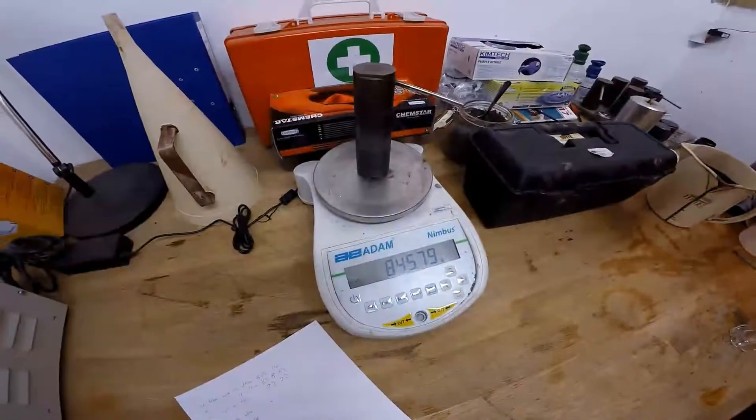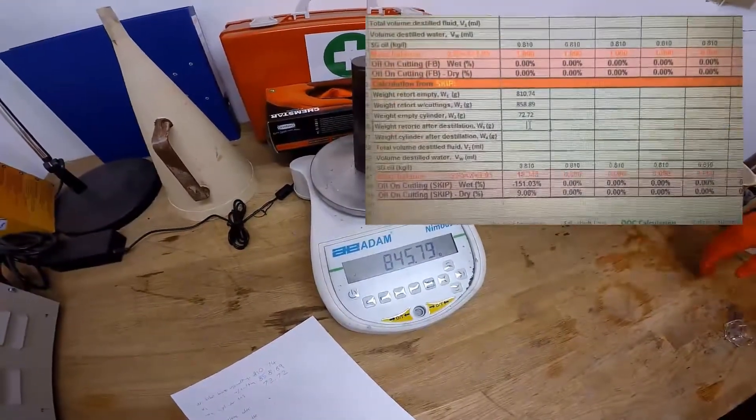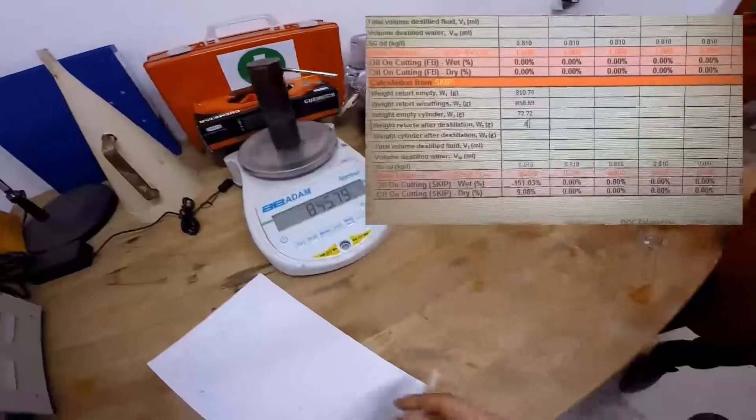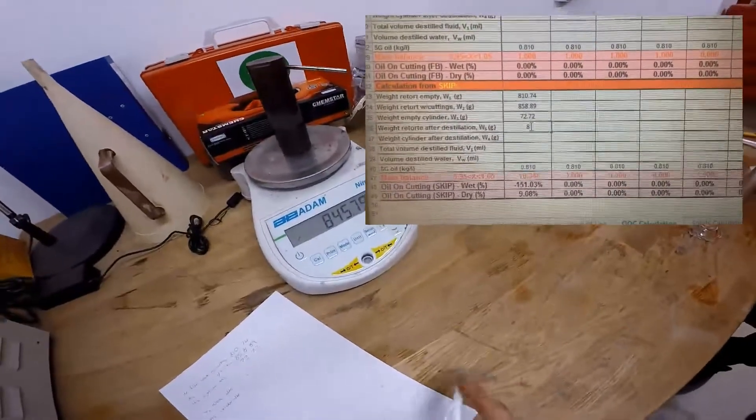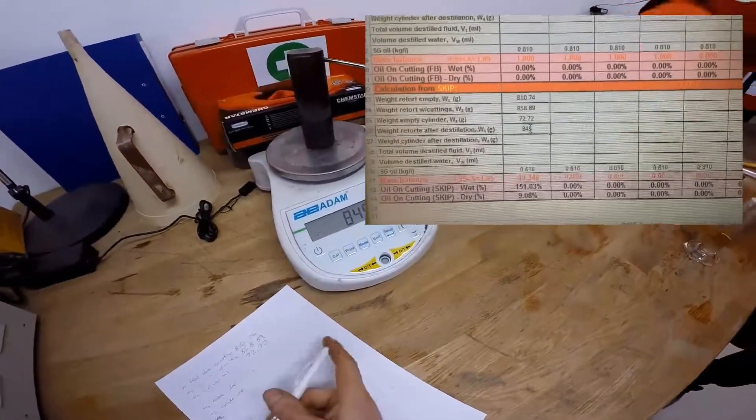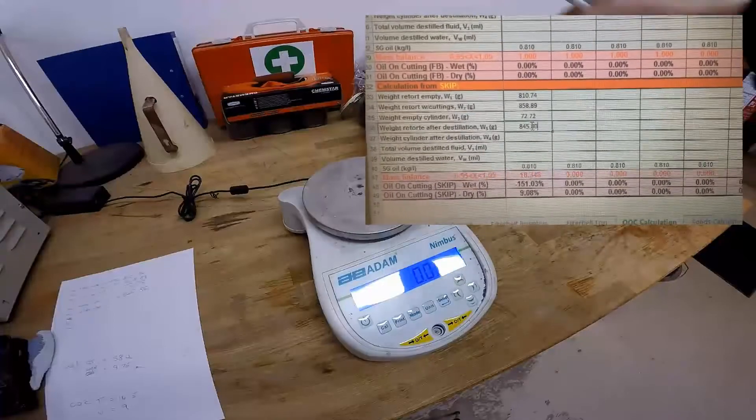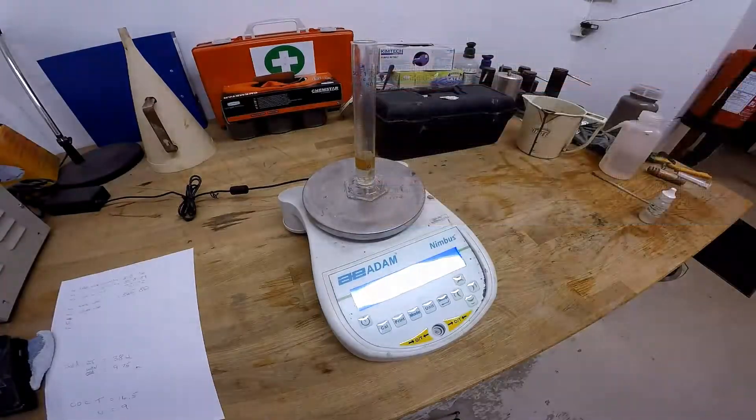So we need the retort weight after burning so we can put that into the computer, and also one of the cylinder after burning.